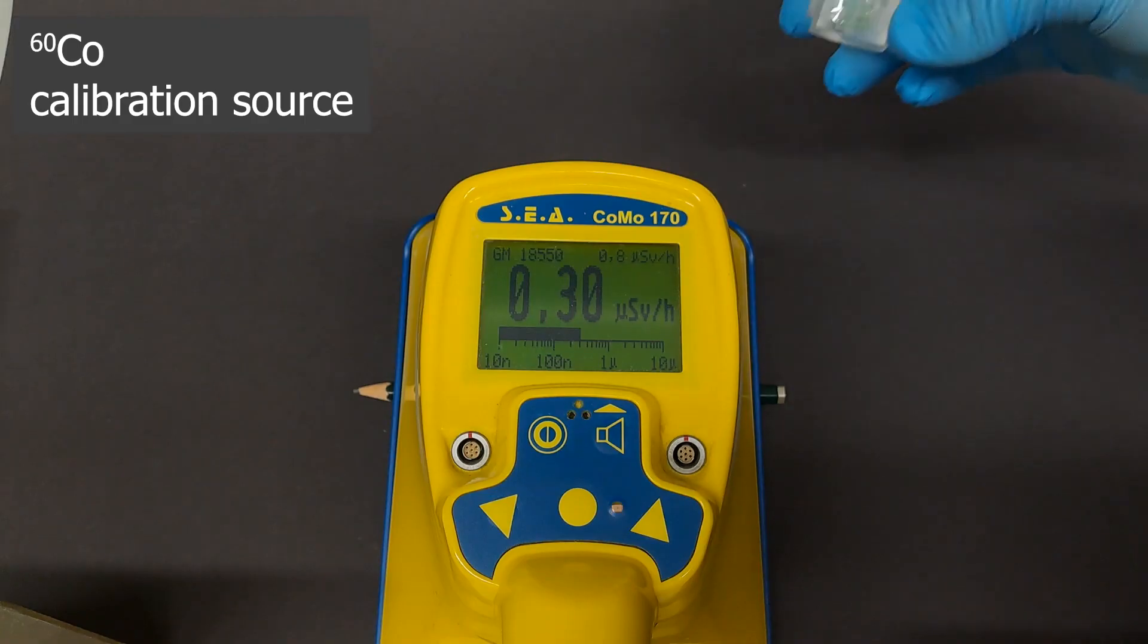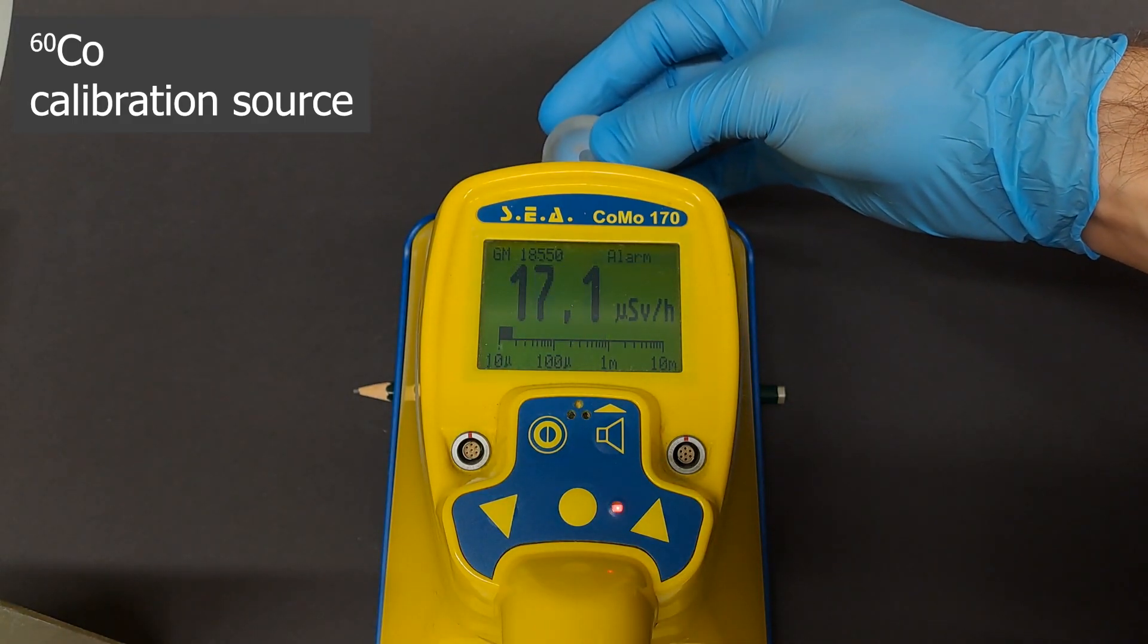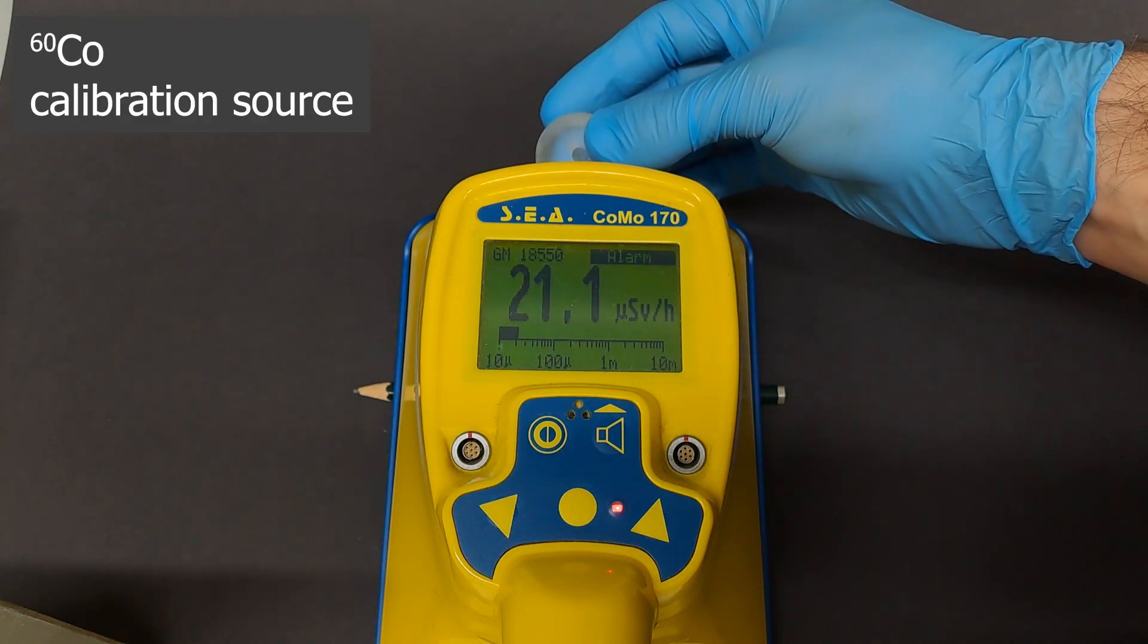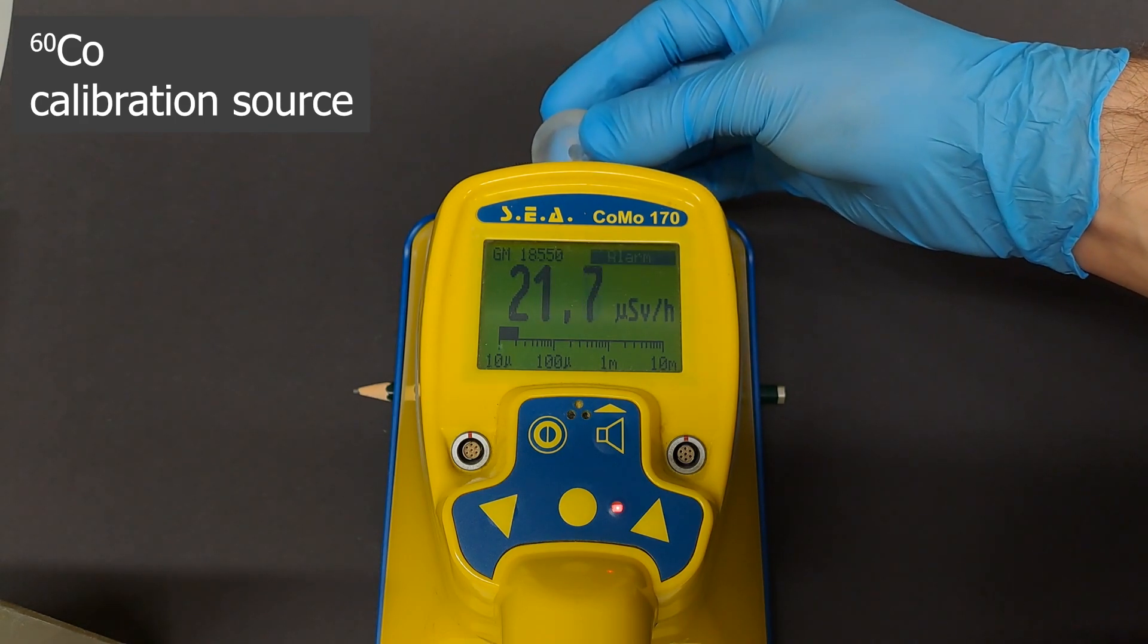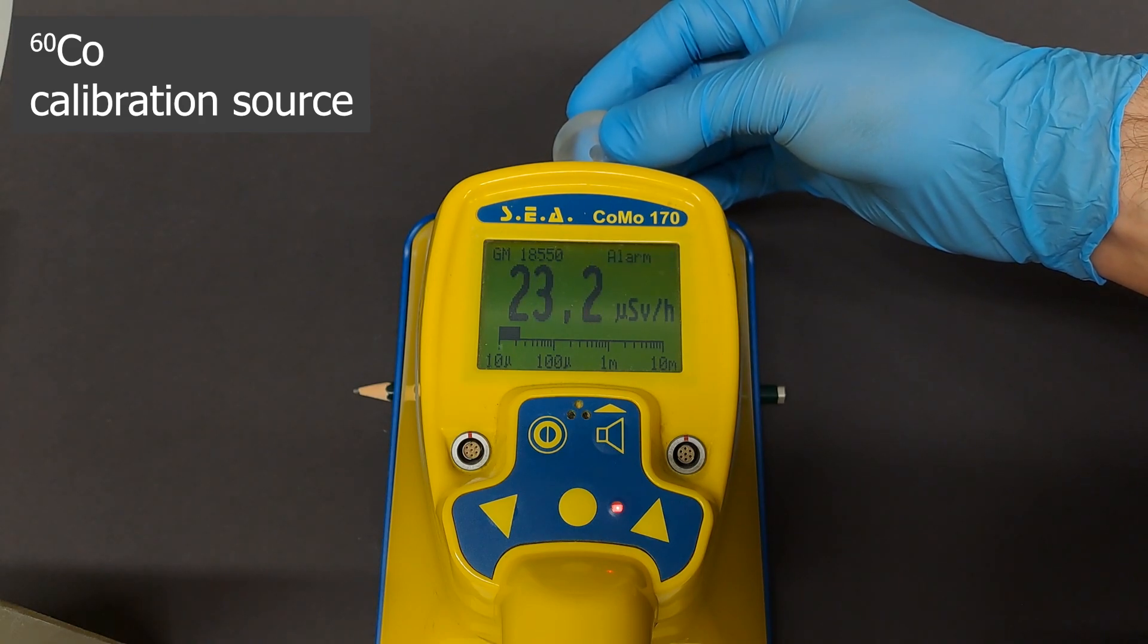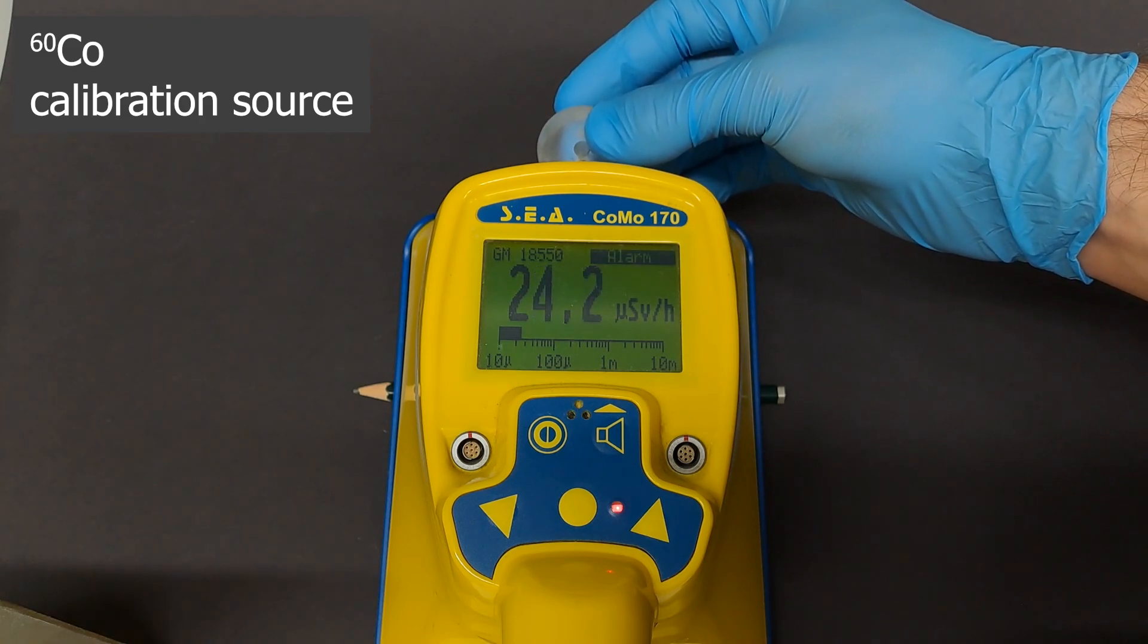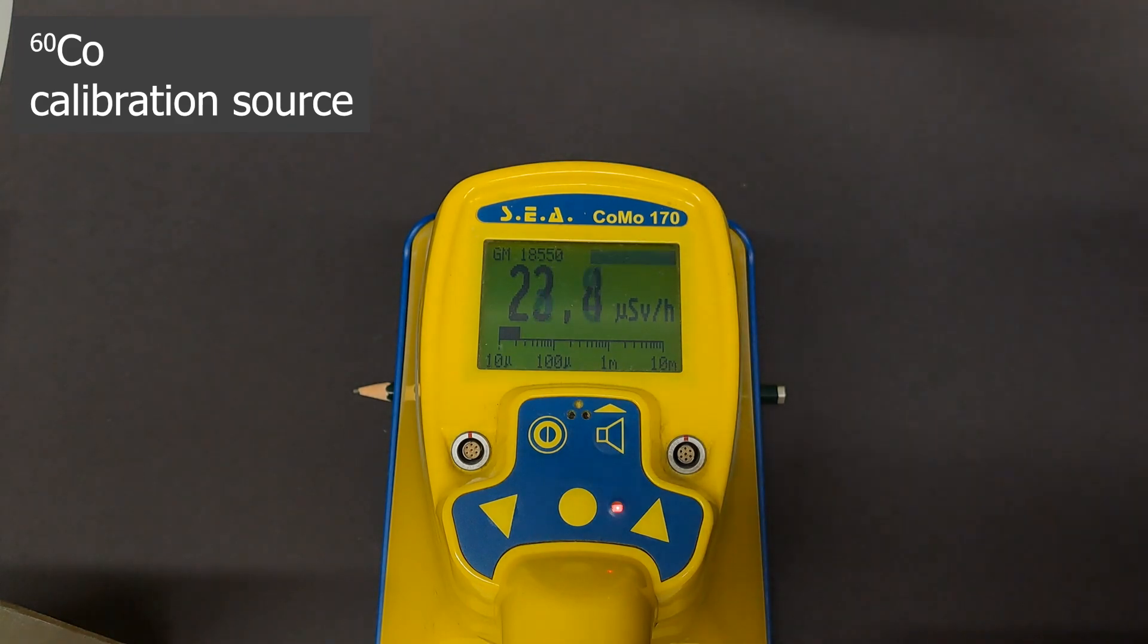To start, let's use the Cobalt-60 sample. To make a somewhat fair comparison, shielded gamma samples are used since the Hobbit device cannot measure alphas. This means we can only measure the dose rate coming from beta and gamma radiation. The peak value here is 24.6 microsieverts an hour on contact.